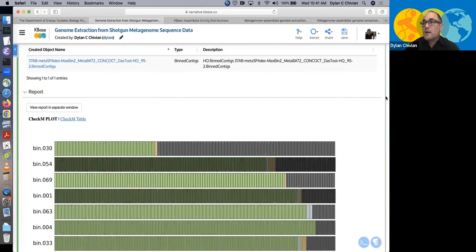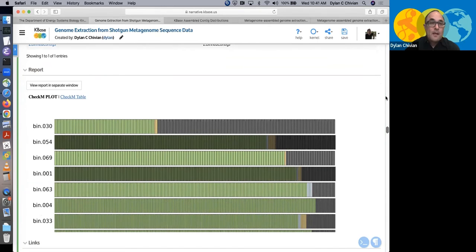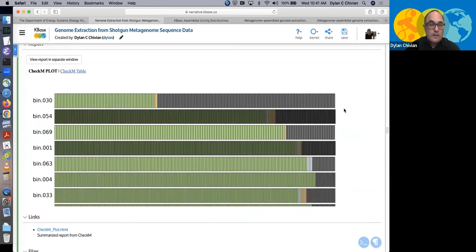This is because they're often present in more than one copy in a genome, and therefore the assemblers get confused and don't wind up being able to span repeats. This is also true for longer transposons, where there can be multiple copies that are identical or virtually identical in sequence. And so this breaks assemblers' abilities to join those shorter contigs as they're doing the assembly.